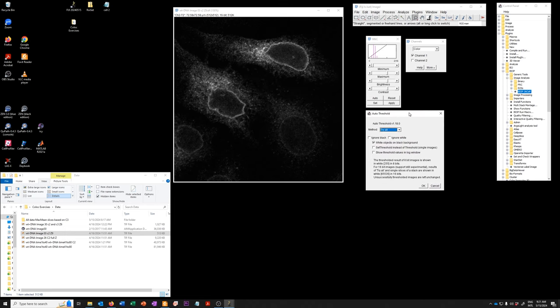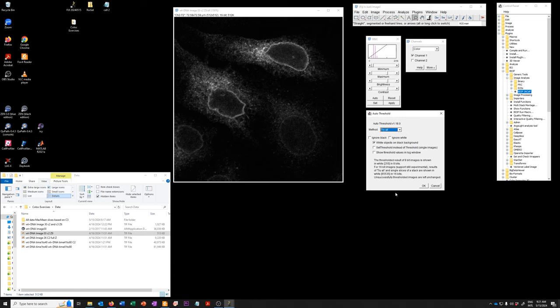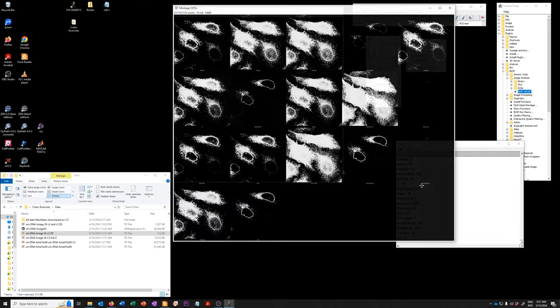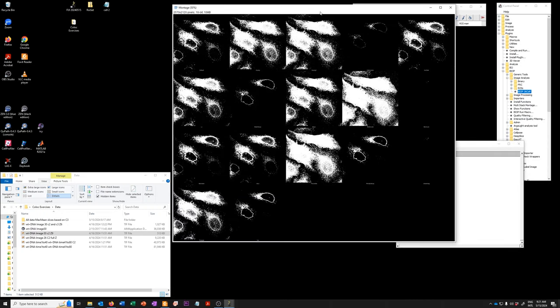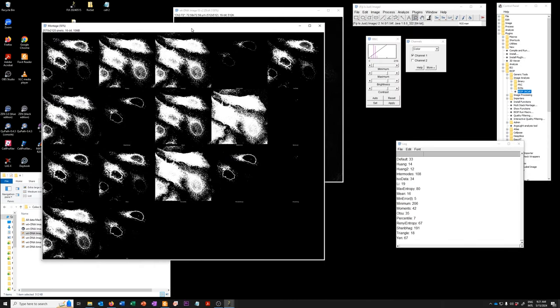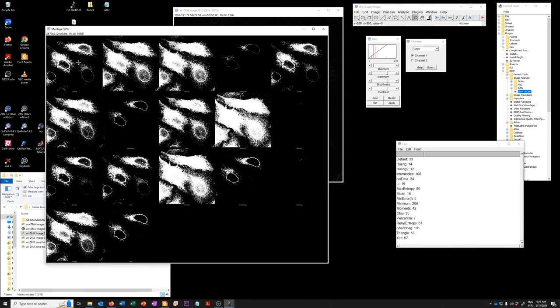So this is a convenient tool if you're not sure which thresholding method might make sense for you because you can try all the methods the automatic methods that Fiji has included. You want to make sure you have white objects on black background clicked if you're using fluorescence data as I am here and it's nice to show the threshold values in the log window to see numerically how they vary. If you say okay what this will do is create this montage image of the results of the thresholding with the different methods which are noted here.